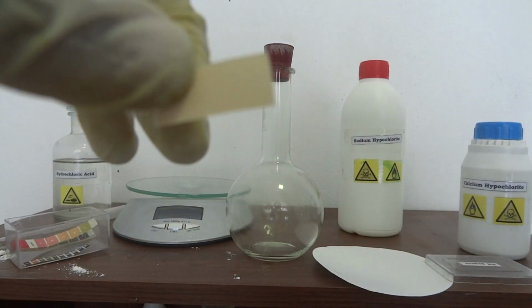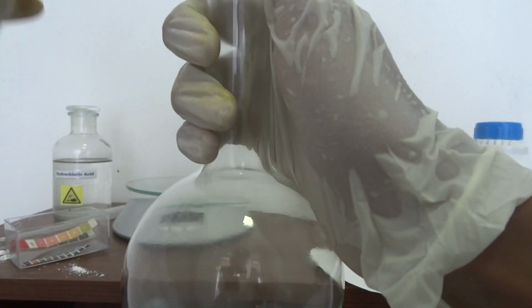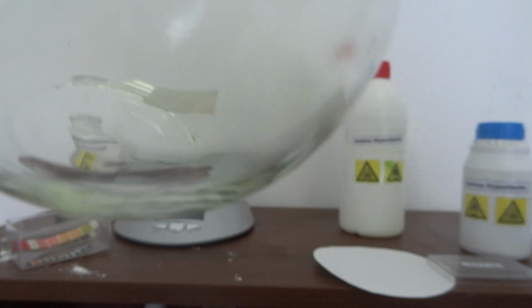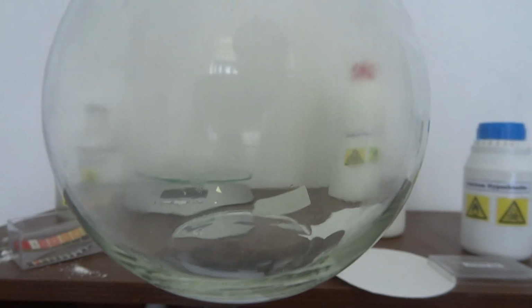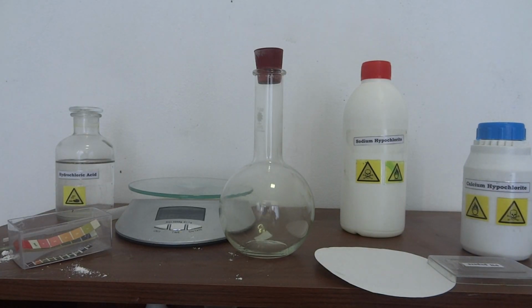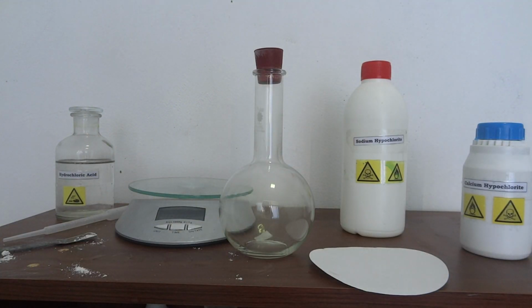Here's the pH paper, and when I quickly put this, you can see that it whitens, becomes white. This is because chlorine gas bleaches the pH paper. If we saw it properly, it quickly turned red, indicating that the chlorine is acidic, and also it quickly turned white because it got bleached.